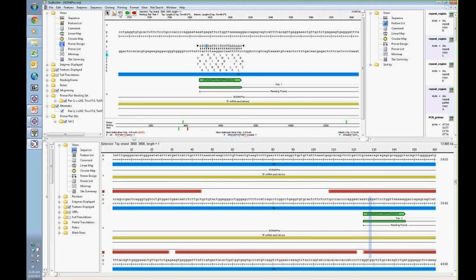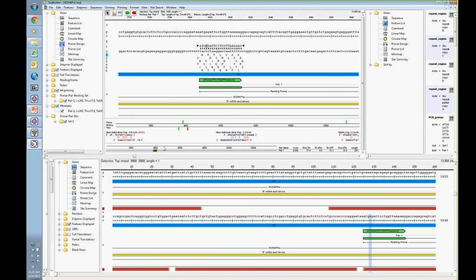So for example, as you can see here, there's a number of false binding sites, which is noted here by those green checks for the top strand primer, and then there's one for that bottom strand primer. So say you want to make a silent mutation that obviously is not going to affect the translation, but it may minimize that false binding site possibility. You do have the ability here to introduce a codon change and a silent mutation. And there's also a palette tool to quickly navigate between the top strand and the bottom strand primers, like so.